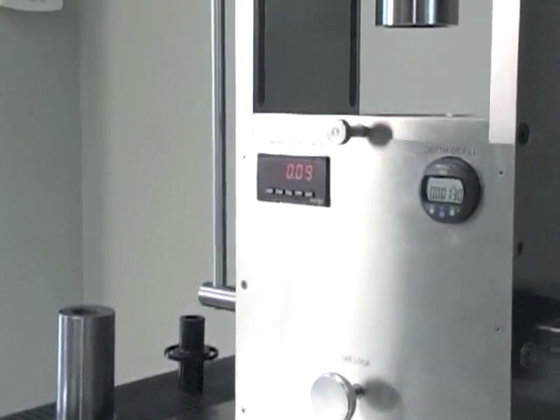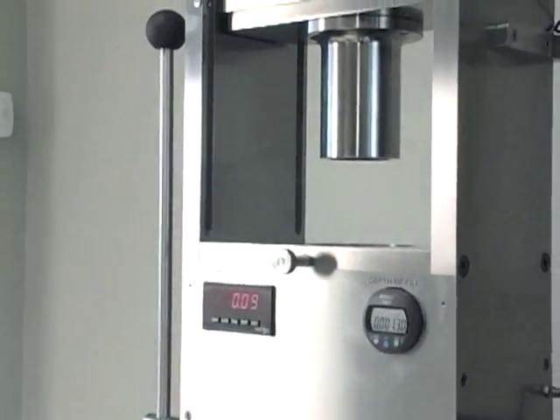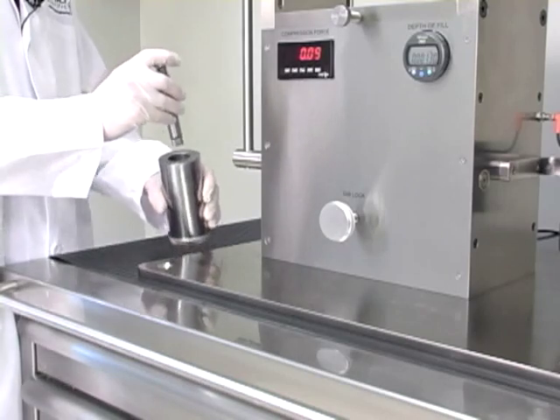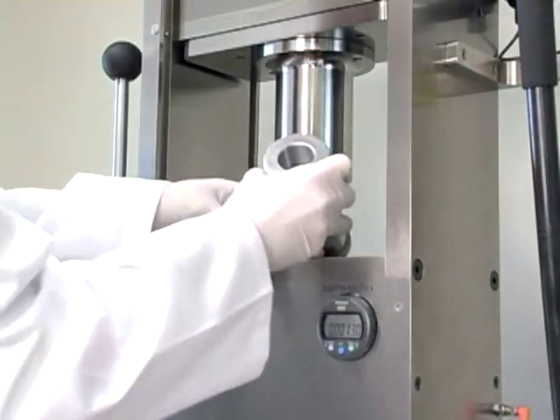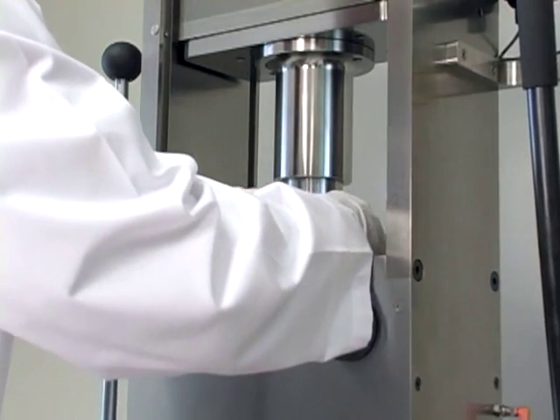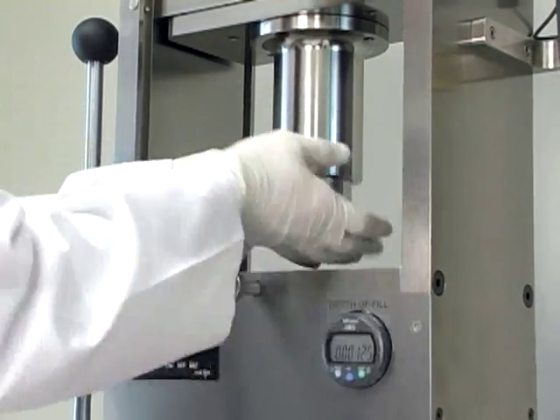Next we're going to install shape tooling on the NPRD-10A. The first thing you do is pump the hydraulic pump a couple times to lower the ram. Next we install the upper punch into the upper punch holder, then you install the upper holder into the machine. Do not screw it all the way down until it's tight — you need to leave it loose.